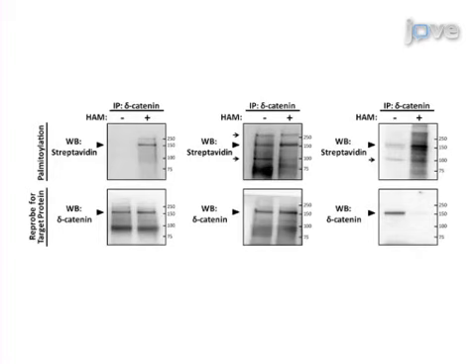Ultimately, the ABE assay is used to show levels of the lipid palmitate reversibly attached to a neuronal target protein, and can also detect subtle changes in the target protein's palmitoylation levels. The main advantage of this technique over existing methods, like detection of protein palmitoylation using metabolic labeling with tritiated palmitate, is that the acyl-biotin exchange assay is more sensitive and less time-consuming.